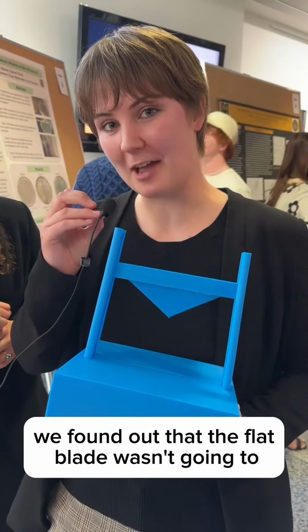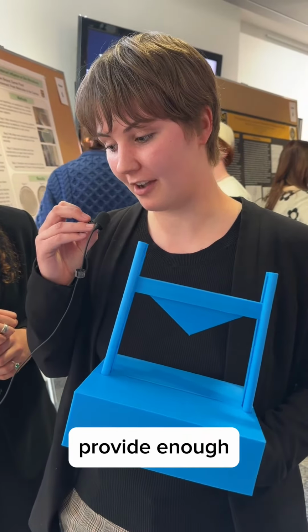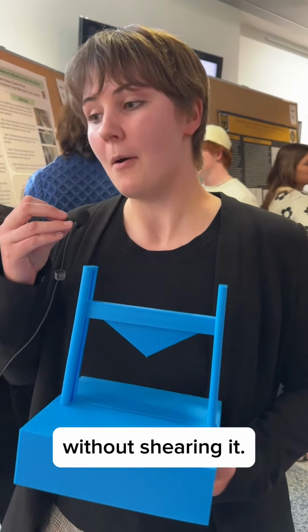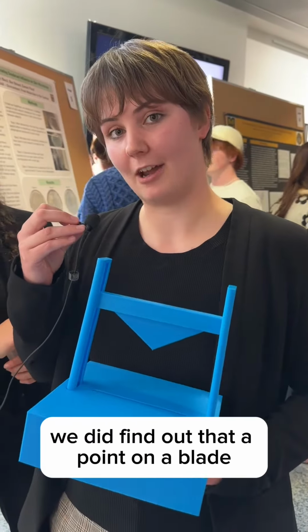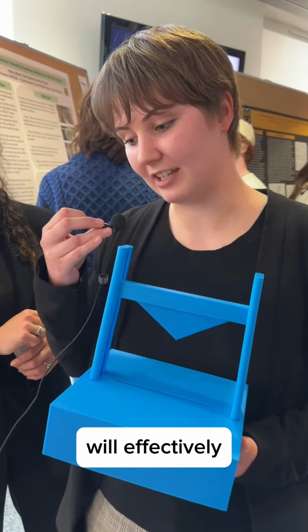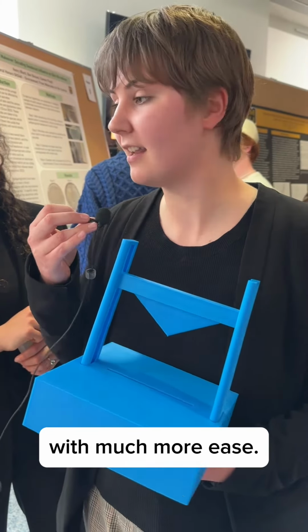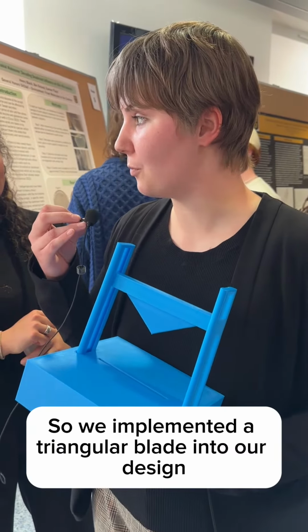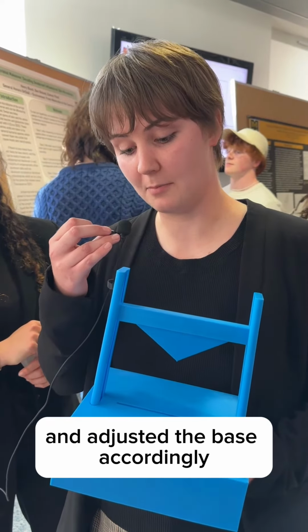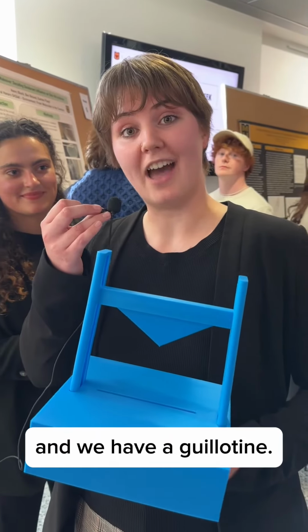Essentially, we found out that the flat blade wasn't going to provide enough force to both puncture and cut the block without shearing it. But after some more testing, we did find out that a point on a blade will effectively puncture the block and then allow you to cut through it with much more ease. So we implemented a triangular blade into our design and adjusted the base accordingly, and we have a guillotine.